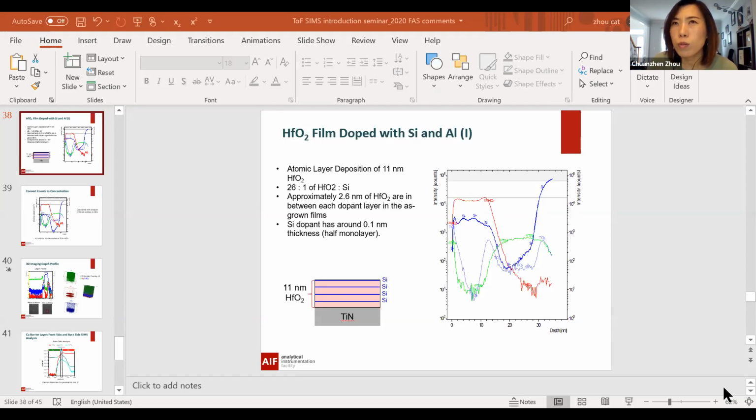The reason that people don't use time of flight to do the quantification is the chemical fragmentation is so complicated, and it's also related to different matrices. For the same materials in different matrices, it gives you a different secondary ion yield, a different secondary ion intensity. And for one material, you can get as many different ion fragments. So how you can do the quantification for every material, that's very hard. XPS is possible because you are dealing with elements and there's only that many elements. So you can do the relative sensitivity factor of different elements versus carbon.